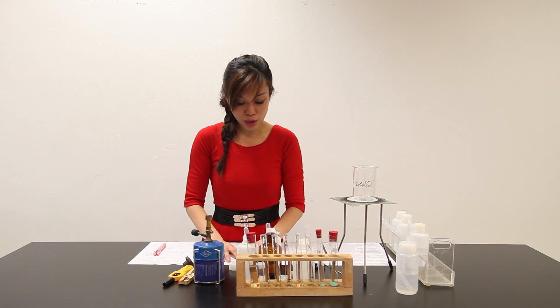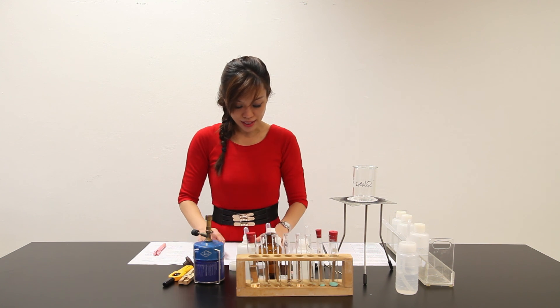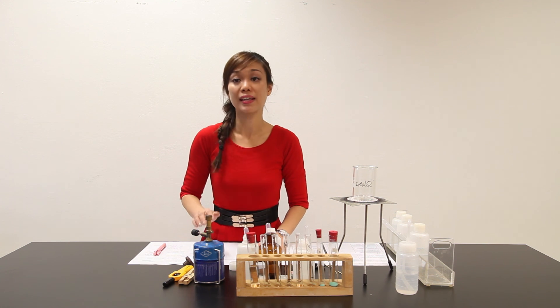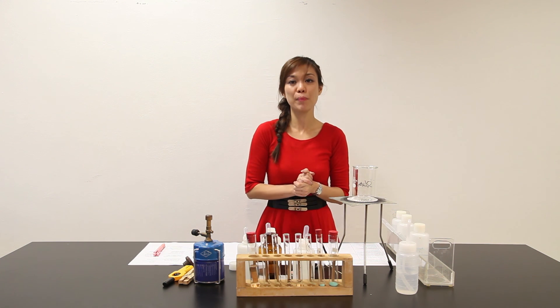Part H says we are supposed to suggest an identity for Acid Y and give evidence to support the suggestion. For the last portion, I am supposed to give two further conclusions about the ions and gases involved in this reaction. I have finished my preparation.